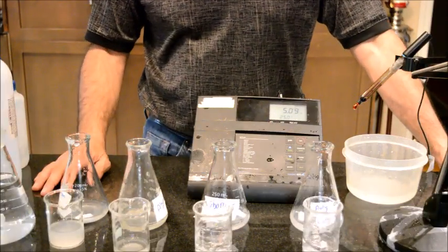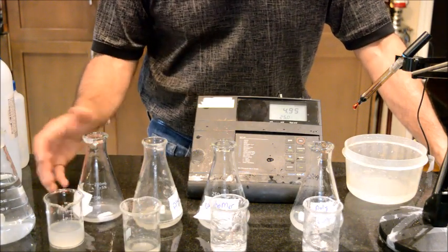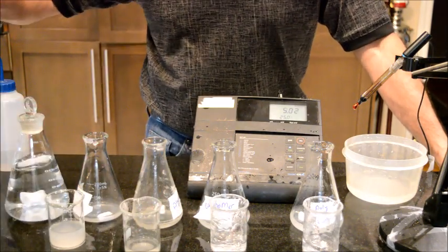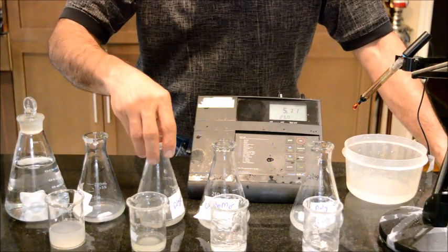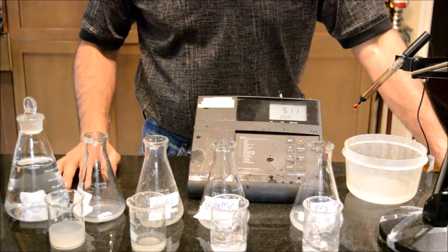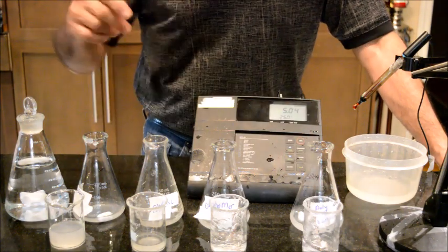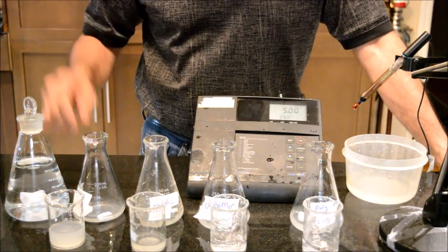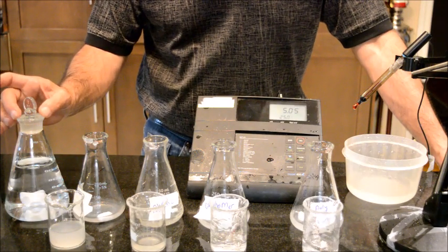Okay, so what I'm going to do next is to add simulated vaginal fluid into these beakers that contain the adjusted pH of these 4 different gelling agents, and you will see how these gelling agents will behave in the presence of the simulated vaginal fluid.